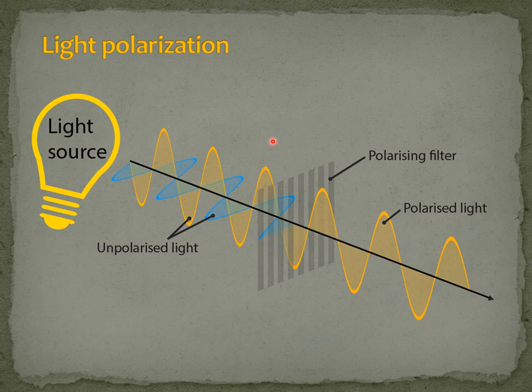So just to try to explain what I'm trying to say. Let's imagine that we have light rays that come only from two different directions, one vertical, represented in orange, and one horizontal, represented in blue.